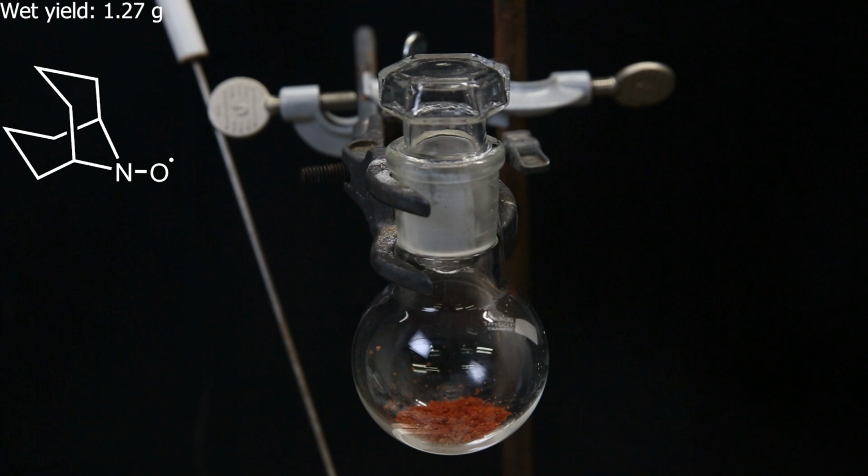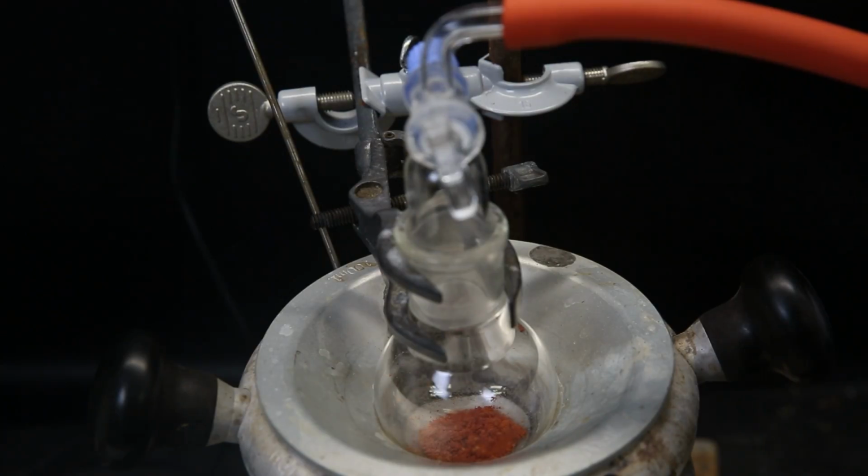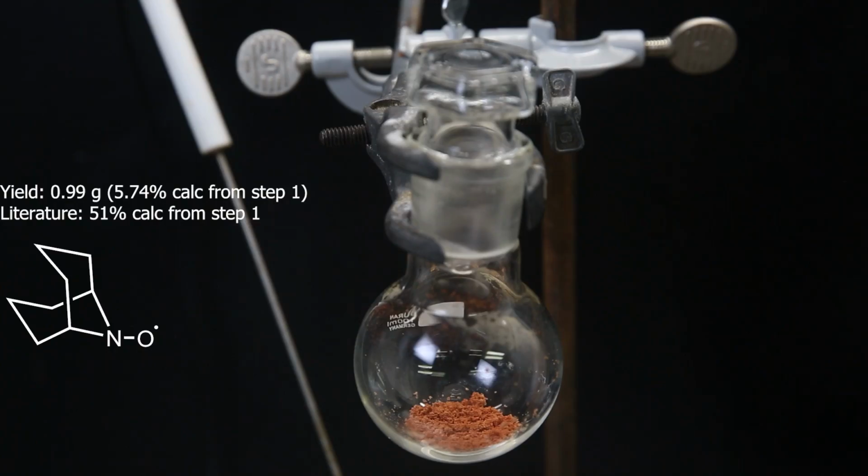Now to remove any remaining solvent, I set it in a heating mantle, heat it to 30 C and pull a vacuum. This will pull out any remaining solvent. We see the solid lightens in color quickly because of the evaporating solvent. And after this, I am left with 0.99 grams of an orange solid.